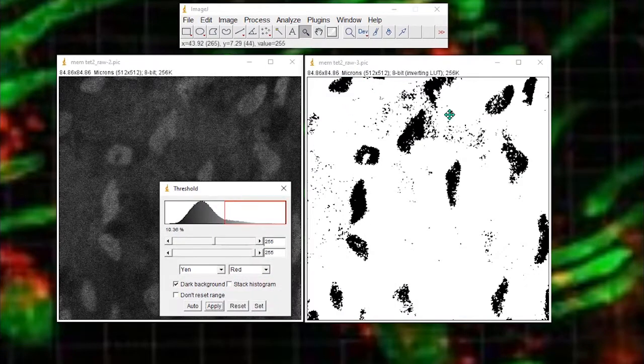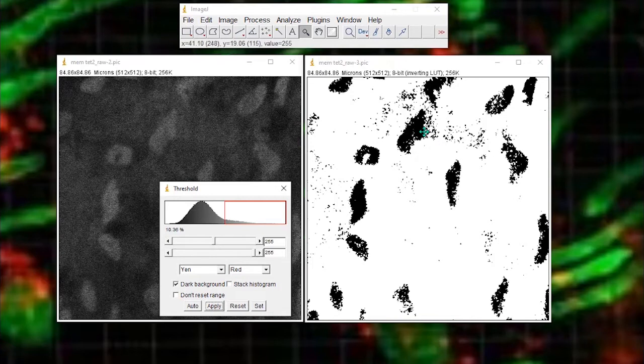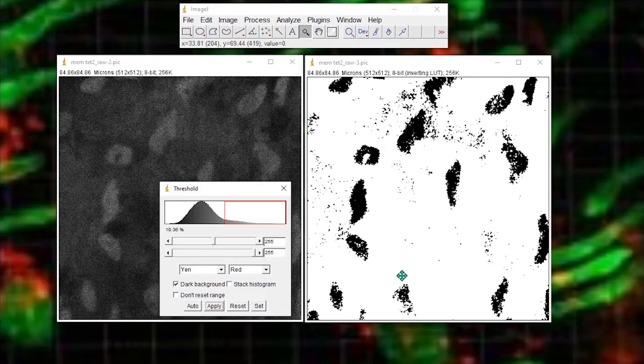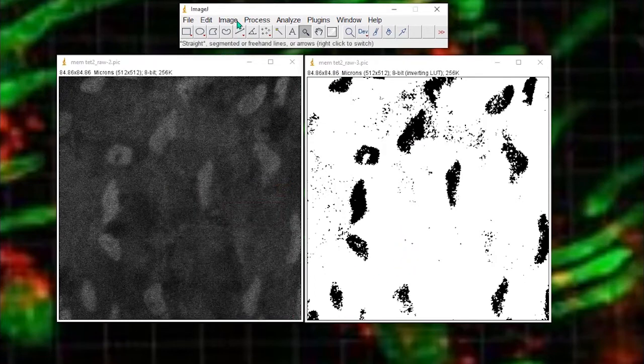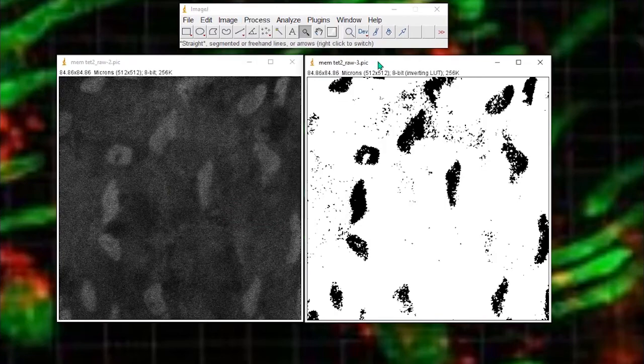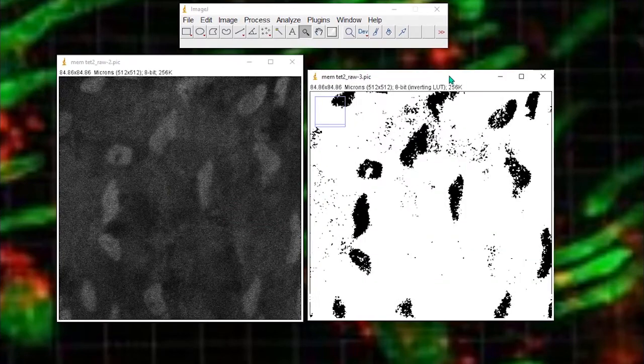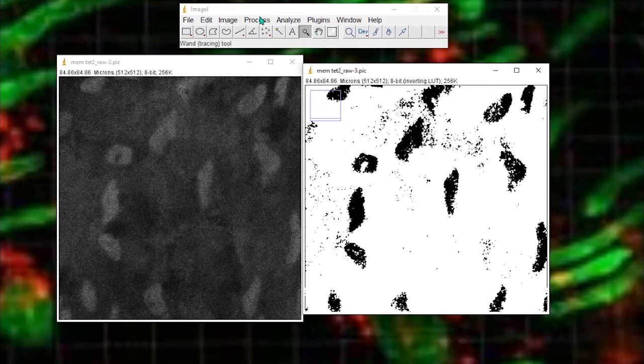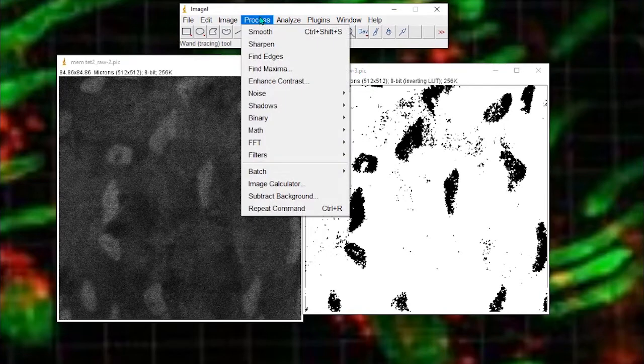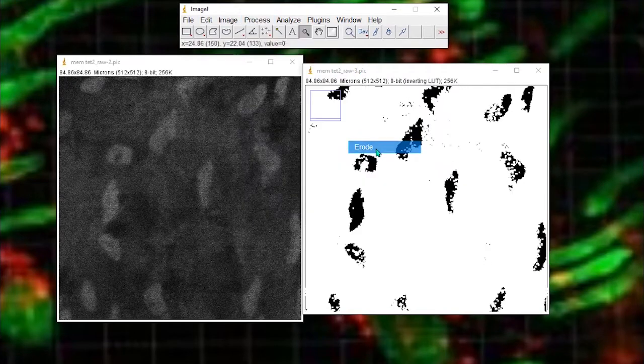I end up with a binary image which I'm going to use as a mask to extract data from the original image. But I don't want all of these single pixels that are lying around here. So I will erode this binary image. Make sure my image is selected. And I'm going to erode.